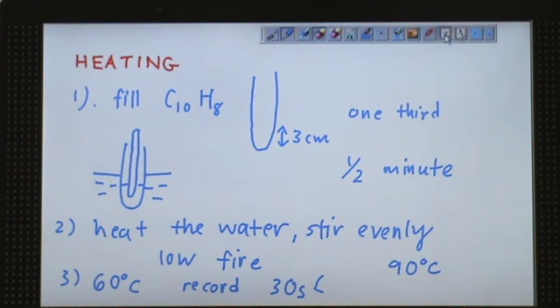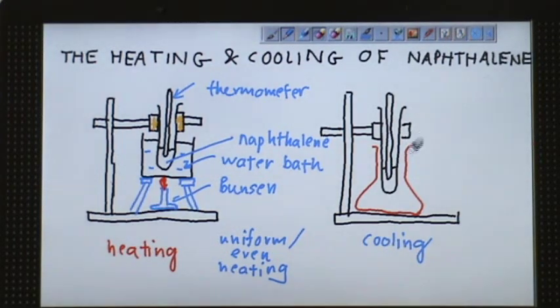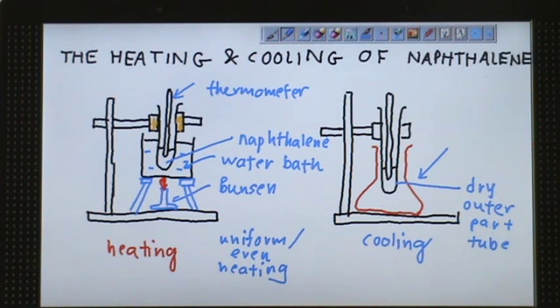For cooling, let's look back at the diagram. We pour out the water, take a new beaker, and clamp the boiling tube with the naphthalene substance and thermometer. Before you put it inside, make sure you dry the outer surface of the boiling tube with a piece of cloth. Putting this test tube or boiling tube into the conical flask helps give uniform cooling. This is the conical flask, not a beaker.